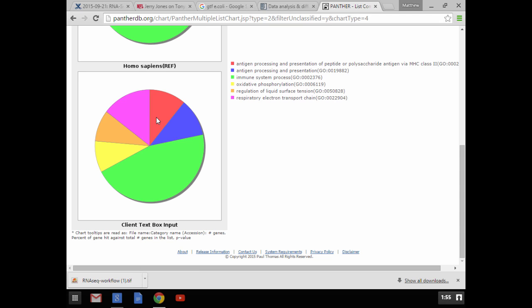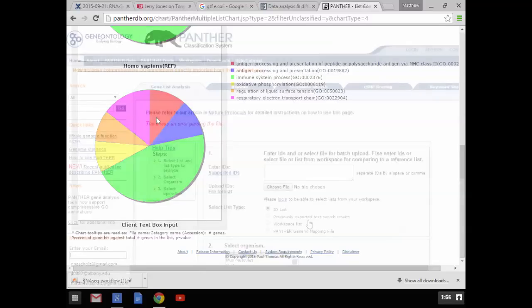They are completely useless for analysis. They are the end result of analysis. They almost never give me, at any rate, any useful information while I have them. I'm making them because I already know something and I need to describe it. So charts should always be your end goal, but are based on understanding and information that are going to come from all of the other stuff that you have to do first. So bear that in mind as we go through this.